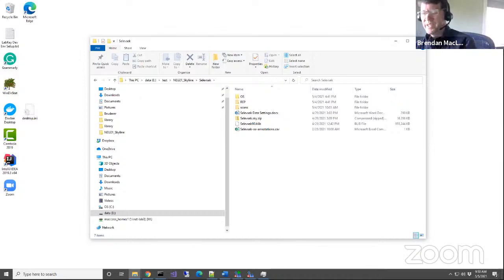We ask them, can you give us a DLL that looks at that file for that answer? Because we don't want to write our own code, because they change things all the time. But yes, it does work.